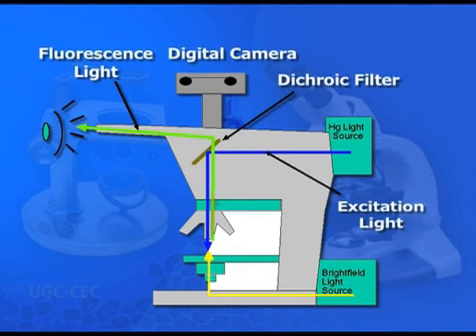The majority of fluorescence microscopes, especially those used in life sciences, are of epifluorescence design. In this microscope, light of the excitation wavelength is focused on the specimen through the objective lens. The fluorescence emitted by the specimen is focused to the detector by the same objective lens that is used for the excitation, which for greatest sensitivity will have a very high numerical aperture. Since most of the excitation light is transmitted through the specimen, only reflected excitatory light reaches the objective together with the emitted light, and the epifluorescence method therefore gives a better picture.